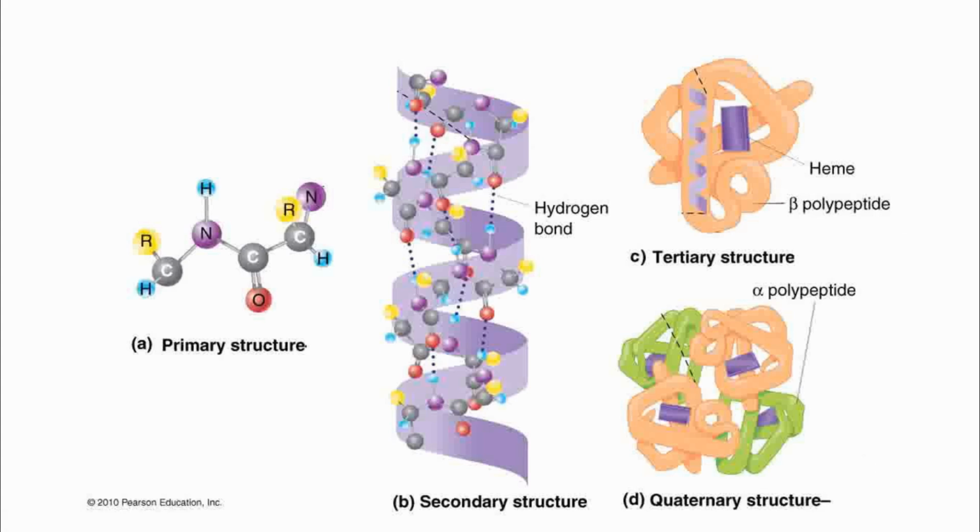So when we are talking of this particular protein, we have to understand that the protein orientation, even for the same type of protein, will not be the same. Suppose you are trying to identify a structure which is fast moving, in free form, so it can move clockwise, anti-clockwise, or in different spatial directions. What will happen is, when you pass the X-rays through your sample, every time, due to the change in the sample orientation, the angle of diffraction and everything will keep changing. So in the resultant information, you will be confused about what is happening with your sample.